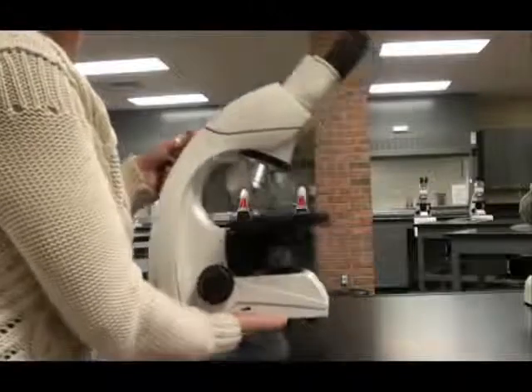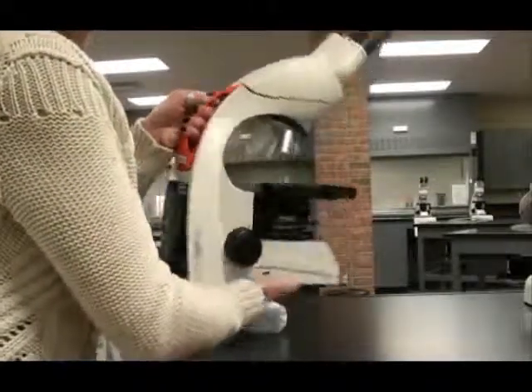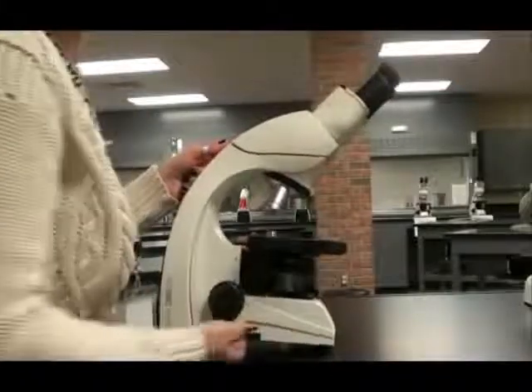Whenever you transport your microscope, you want to make sure to hold it both by the neck and the base. This scope has a nice handle right in the neck, and then have your other hand beneath the base.